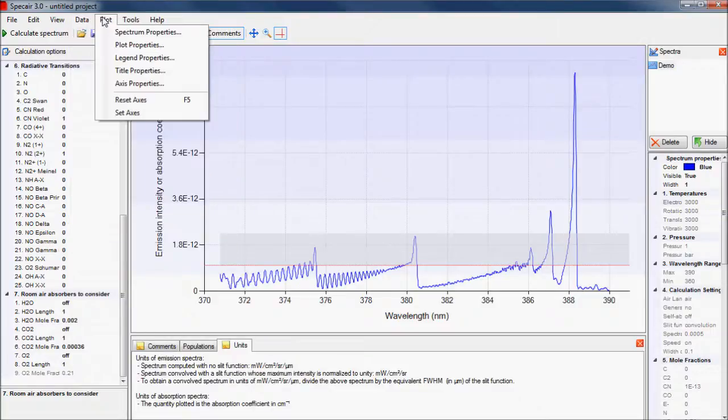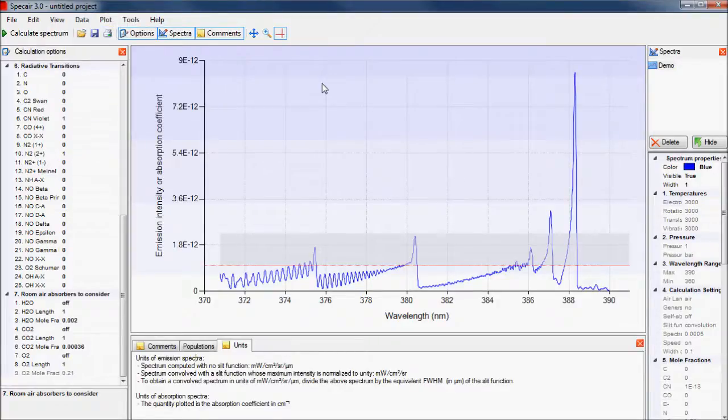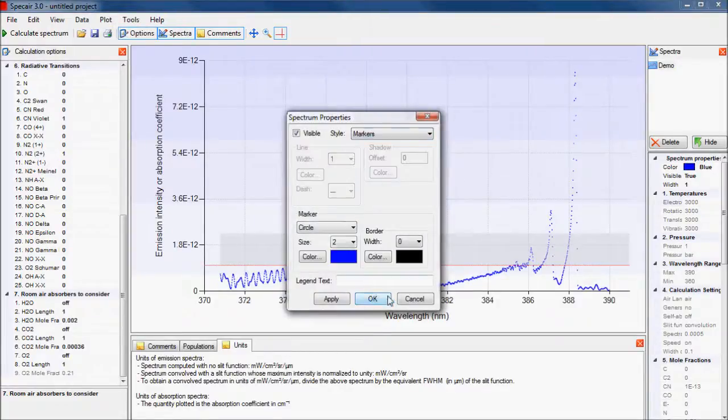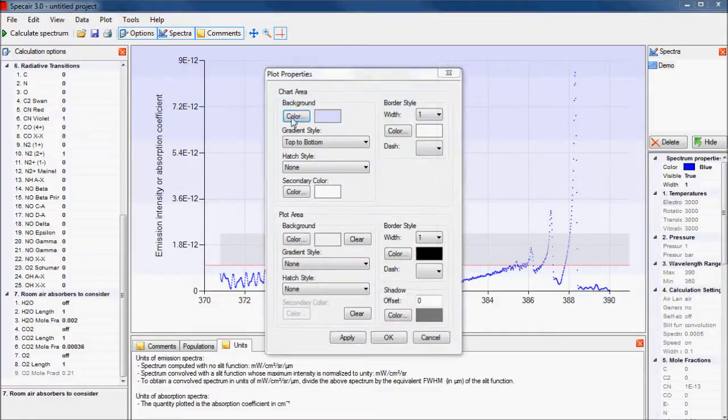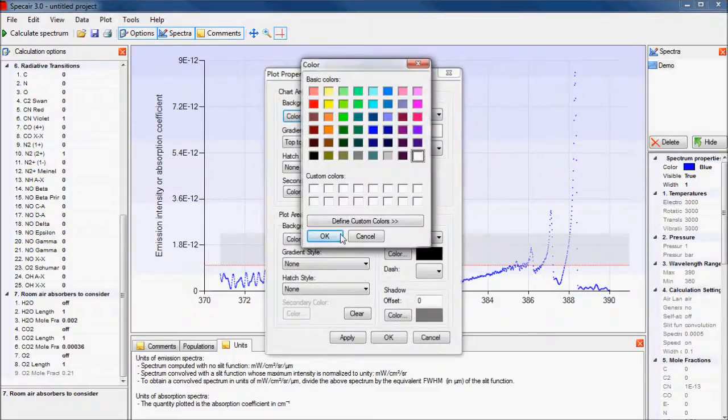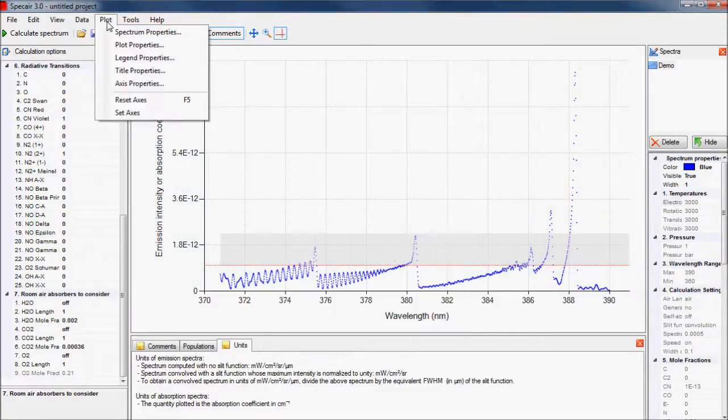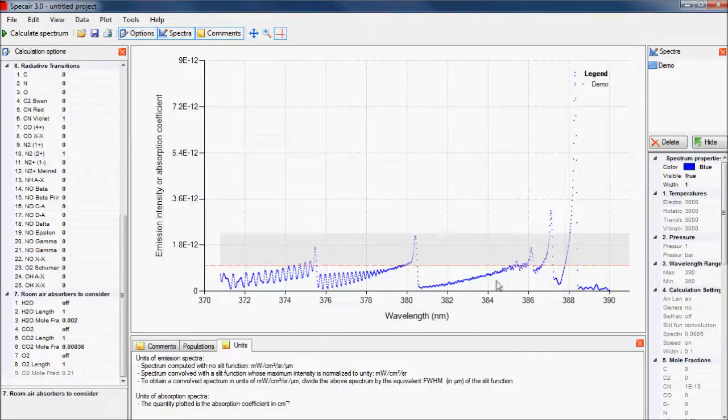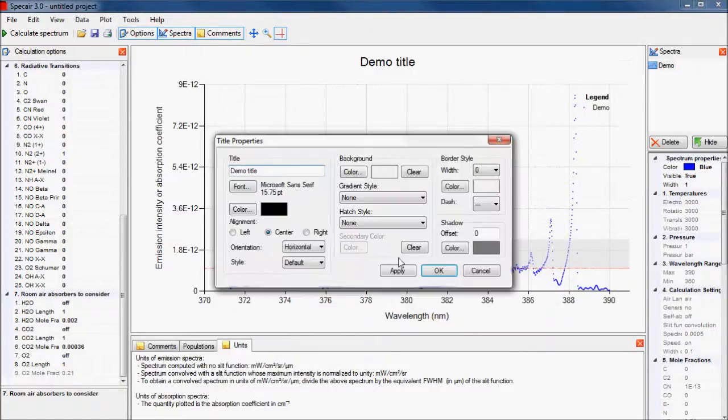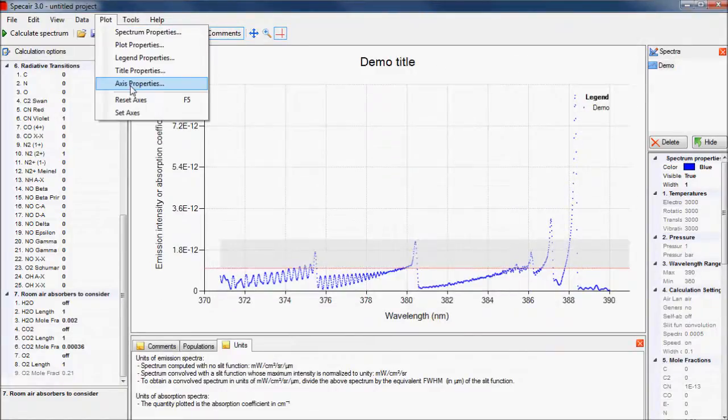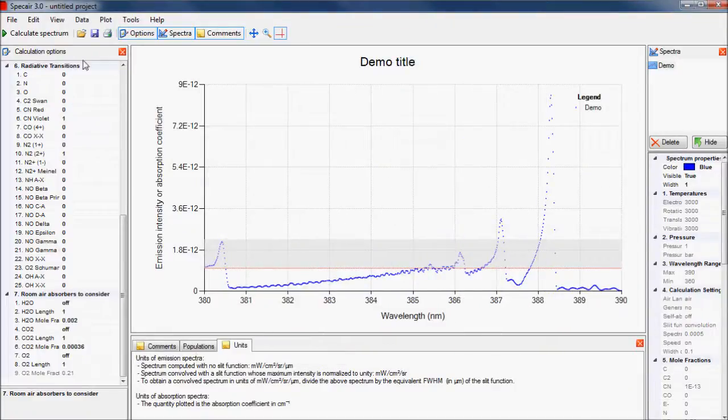The appearance of the plot is changed by selecting options under the plot menu. Many of these options can also be accessed directly by double clicking on the feature you want to change. In this case, we can change the trace to markers instead of a continuous line. We can also change the background, add a legend, and a title before changing the wavelength scale to show the section we want.